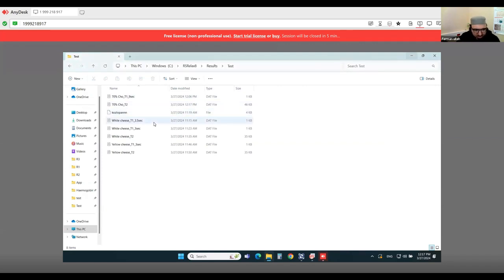Every person has a different approach to using Origin to open the data files. The short one I use: I copy all and bring it here to Origin.